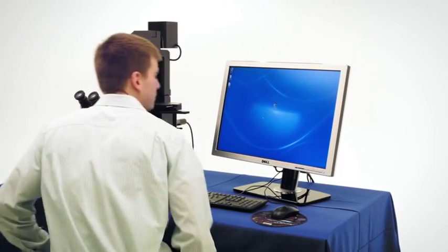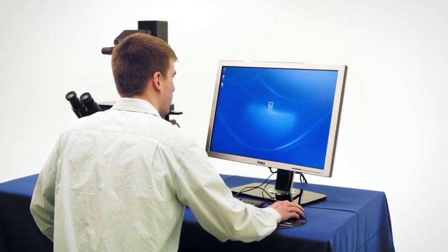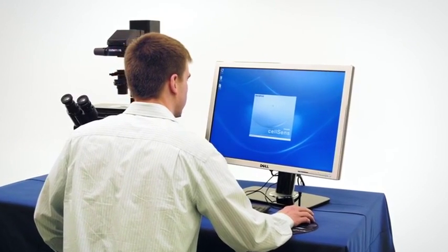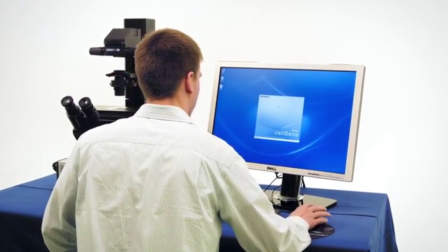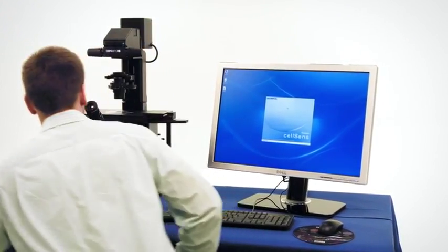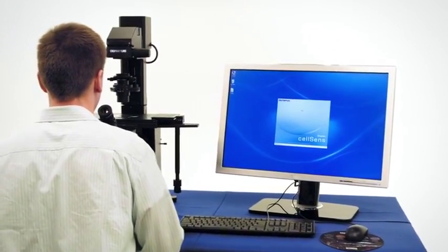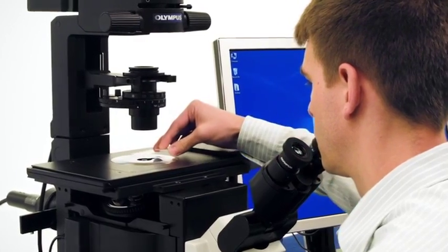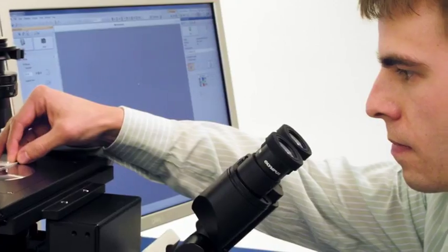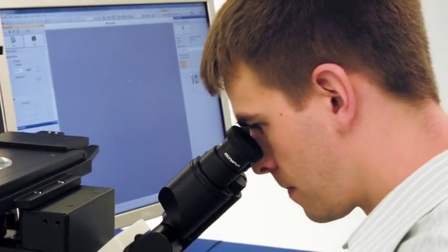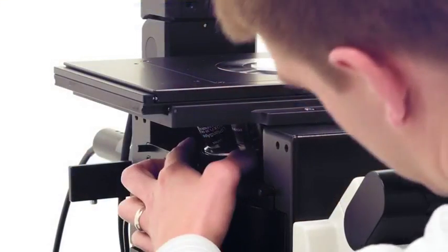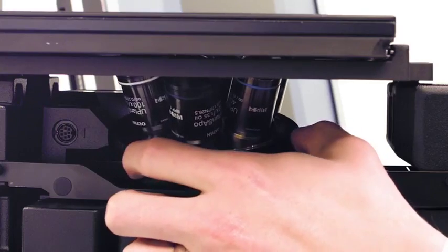There was a time when the operation of light microscopes for documentation and research was complex, making the technique inaccessible for novice users wanting to expand their analytical tool repertoire. Important experimental details could easily be lost if the researcher was not vigilant in writing them down. Creating multi-channel fluorescence image overlays was time-consuming.